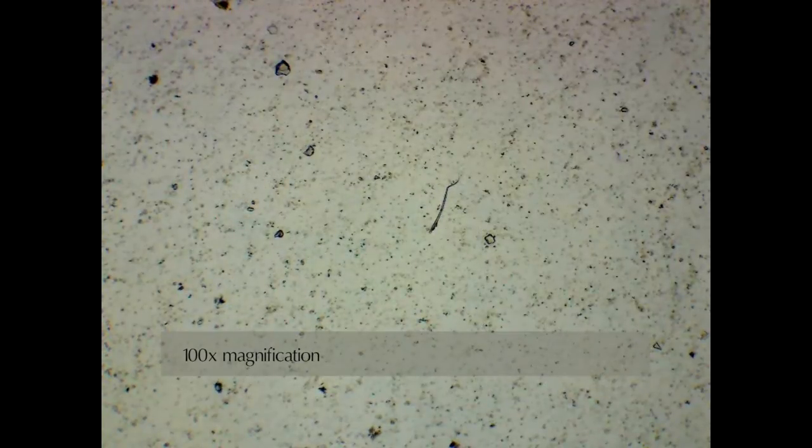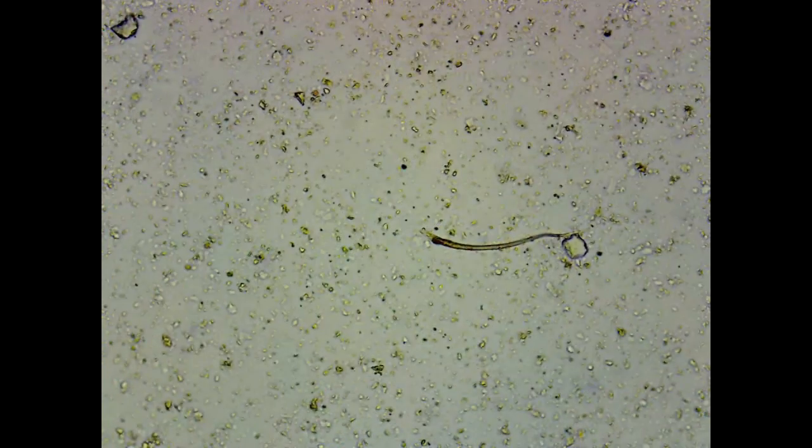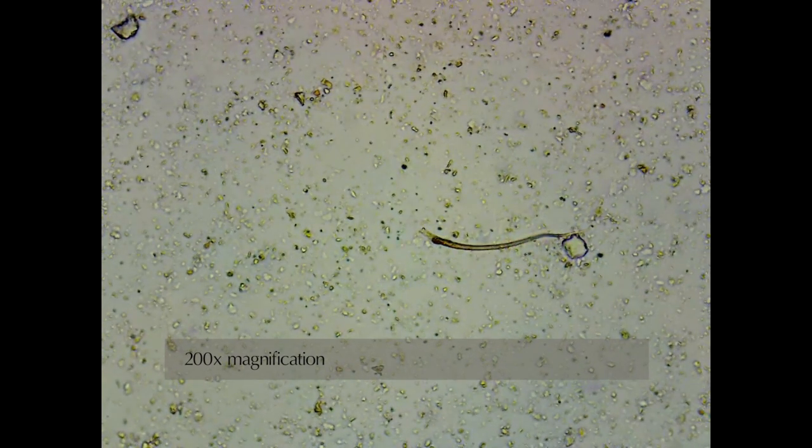Other times, it may seem too crowded at first, but something catches the eye and magnification helps isolate the object, like this algal filament. Yet these images, prepared from the same soil, provide a much clearer example of a similar filament.